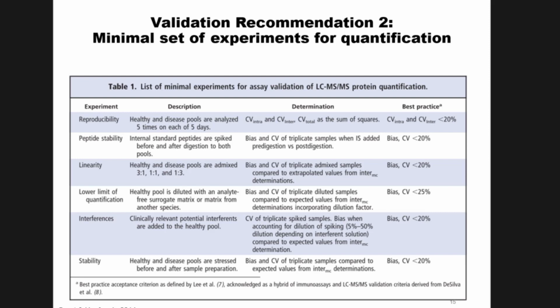Andy has put forth a set of guidelines, especially for clinical practice. And these are some of the data sets that we're going to be looking at after this lecture, which is supposed to be done in 5 minutes. Good to know. So we're going to look at that vitamin D binding paper that we heard a little bit about. And we're going to look at these different validation data sets in Skyline, so you can see what this data looks like.